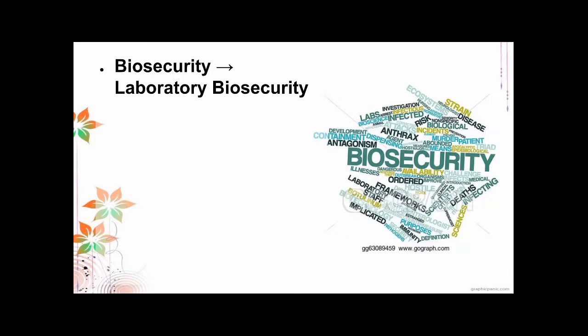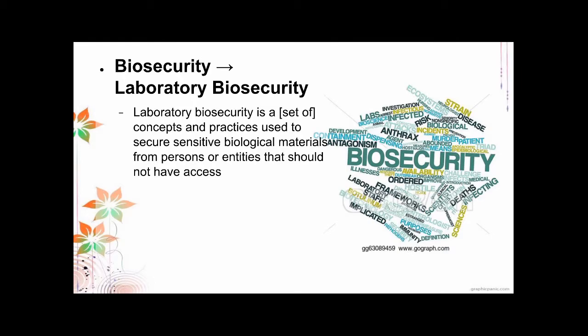How about biosecurity? Biosafety and biosecurity are quite related, and in this case, let's define biosecurity in terms of laboratory biosecurity. Laboratory biosecurity is a set of concepts and practices used to secure sensitive biological materials from persons or entities that should not have access.